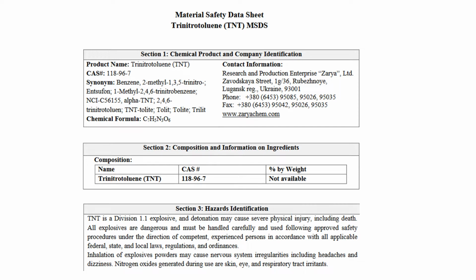A material safety data sheet, or MSDS, as it is often referred to, is a document that serves this purpose. It lists out details of physical and chemical properties, technical data, trade and common names, hazards, remedies on exposure, and safe handling practices on chemicals to users and those involved in their handling and transportation.